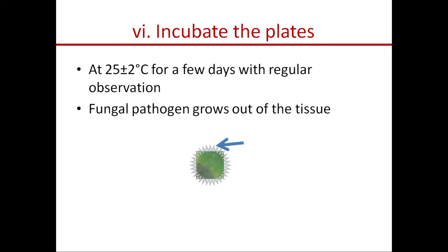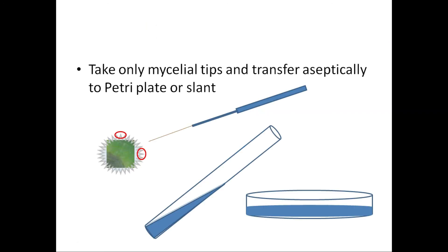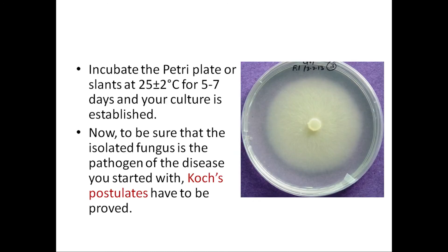Incubate the plates at 25°C ± 2°C for a few days with regular observation. The fungal pathogen grows out of the tissue; you will find fungal mycelia radiating from the leaf tissue, as shown by the arrow marks — the growth may radiate from one side or in all directions. Then take only the mycelial tips and transfer them aseptically to a Petri dish or slant with the help of an inoculation needle. Incubate the Petri plate or slant at 25°C ± 2°C for five to seven days and your culture is now established.